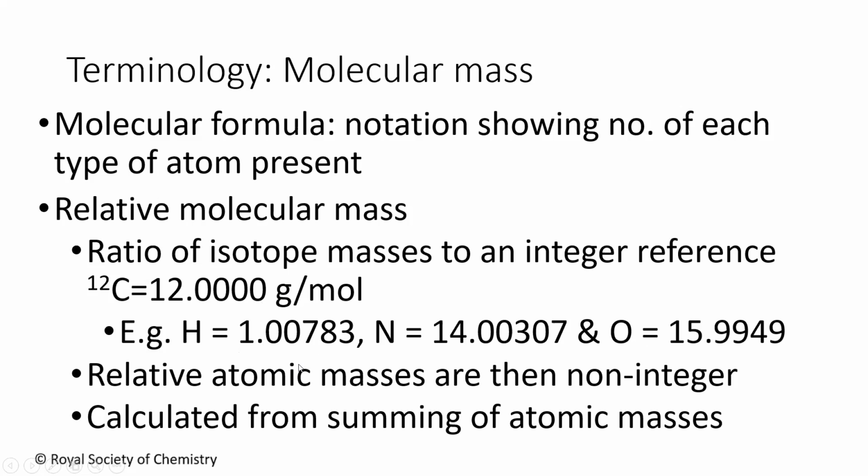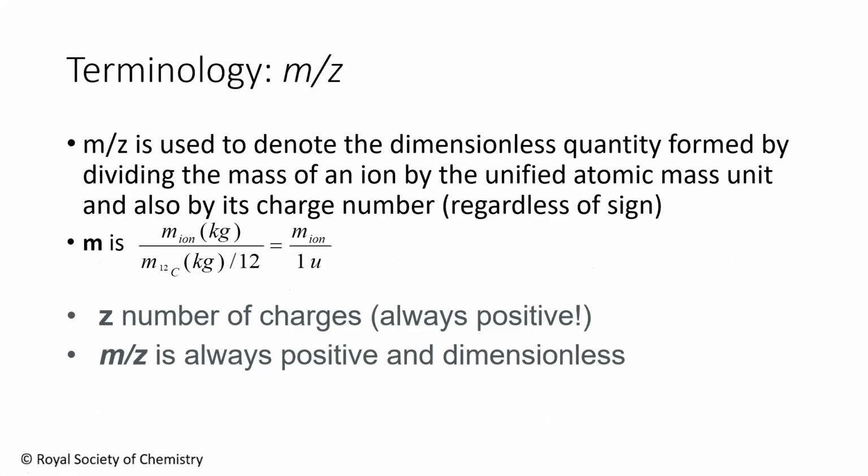So if you have an atomic mass of 28, let's look at nitrogen, for example. Nitrogen will not give us 28 precisely with a mass spec. It's going to give us 28.00614. While carbon monoxide, CO, which is also 28, is going to be 27.9949. So mass spectrometry has the capacity of determining to a fine level the atomic mass of the combining atoms present in a molecule.